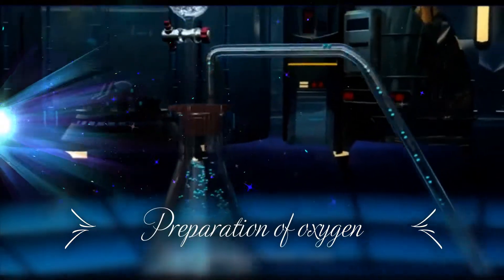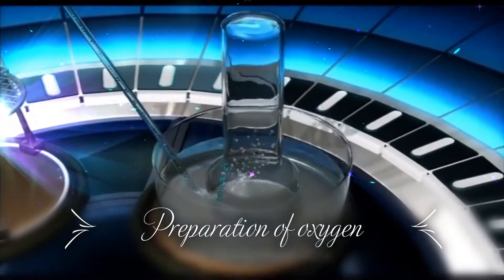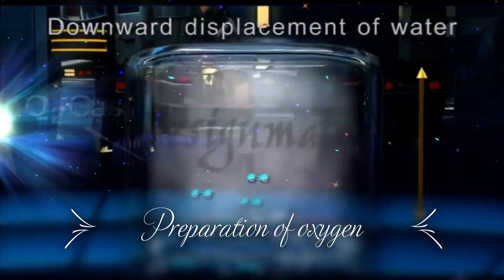Released oxygen passes through the tube, then over the water and starts getting collected in the gas jar. This method of collection of gas is called the downward displacement of water.